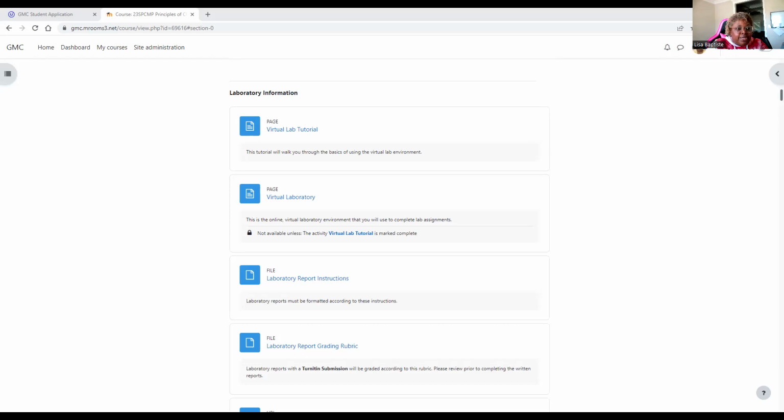So we have 5.6752 grams. And so you're going to write that number down. Once you've done that, you can set that aside. You can tare your balance, and then you can move that out of your way. Okay, we're finished with Metal 1 for right now, so we can move that out of the way.